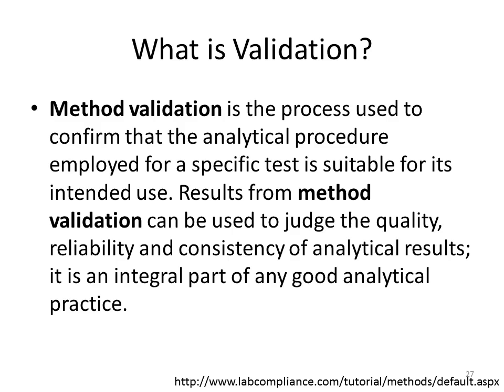Now, validation, I use the term loosely, and I'm not using it correctly. Validation, again, as I had said before, in pharmaceutical companies has a very particular meaning. But here it's defined as the process used to confirm that the analytical procedure employed for a specific test is suitable for its intended use, right? So you want to set up a method that detects your analyte with a certain level of precision, a certain level of accuracy, and a certain level of ruggedness and robustness.